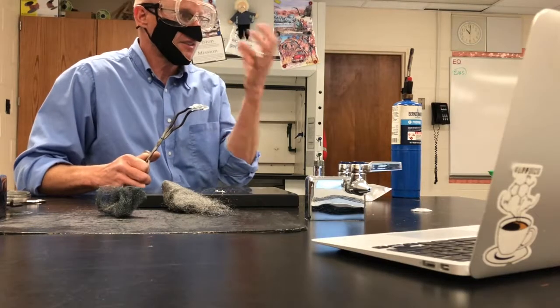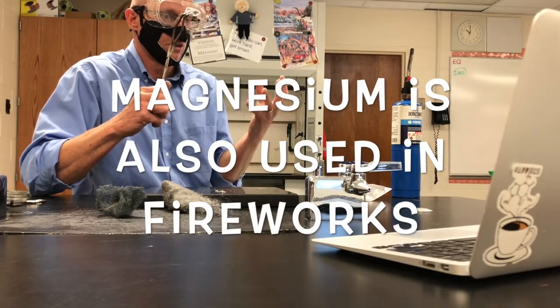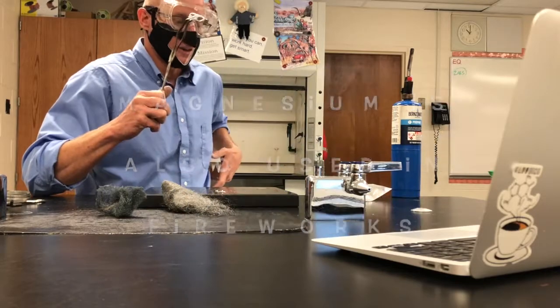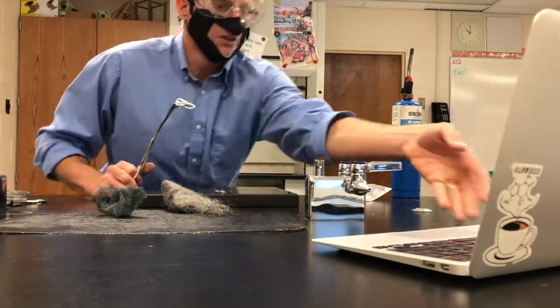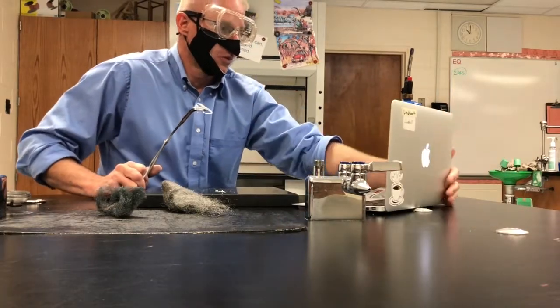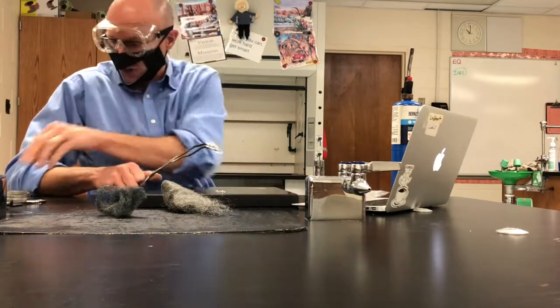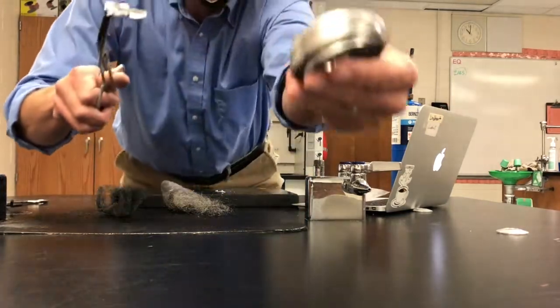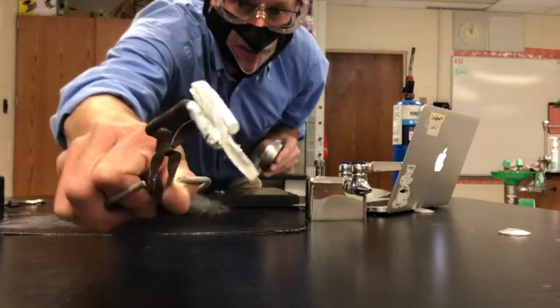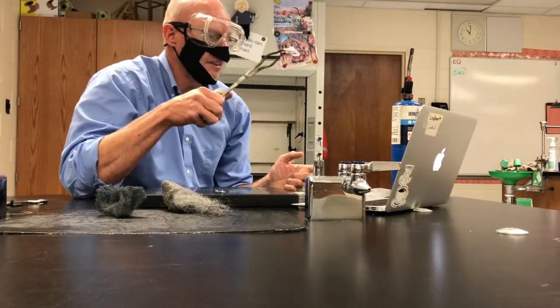But the white light that you saw, that's the light that you get when magnesium reacts with oxygen. So just like I reacted the steel wool with oxygen, when I react magnesium with oxygen, you can see the magnesium has changed. Okay? That is how it started. And there's this white powder. This white powder is called magnesium oxide.